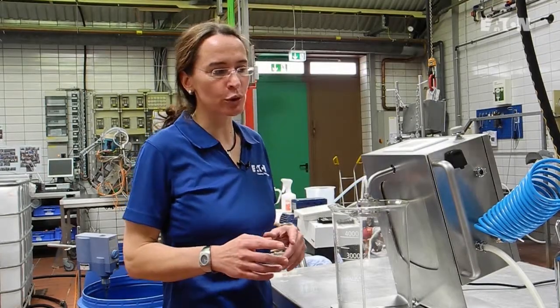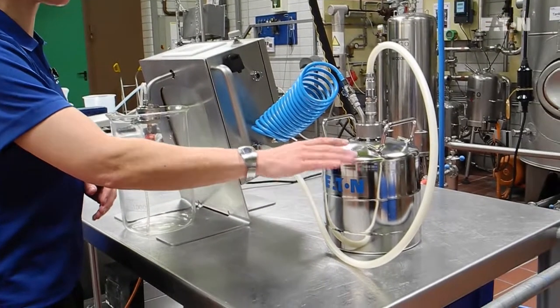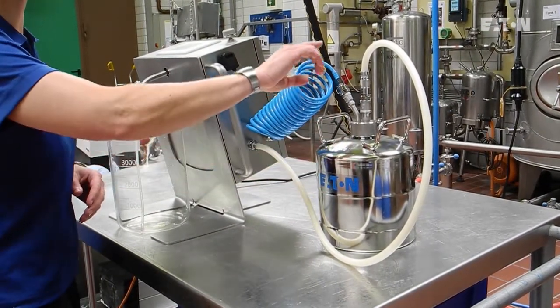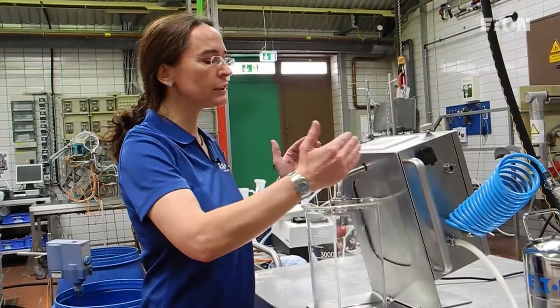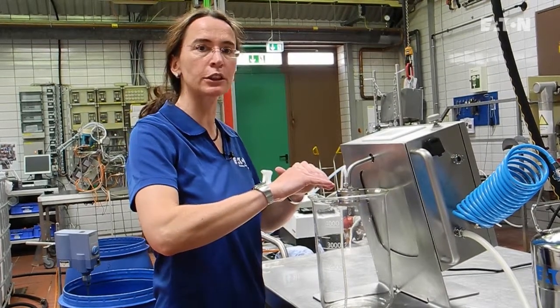First of all, I want to show you how the equipment works. We have here a storage tank where we can put in five liters of wine, for example. These five liters will be transferred into this measurement unit, and then we will filter the wine from the storage tank over a membrane or a filter sheet.